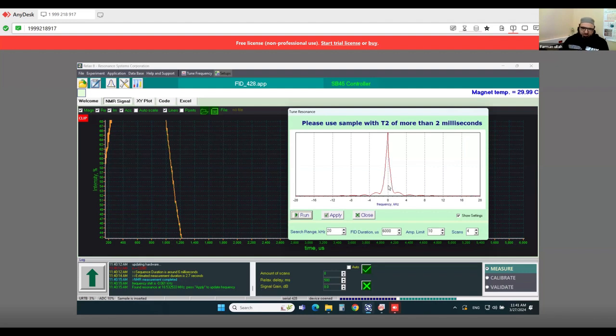There may also be some other factors, but as I told you, you have to give some time to the sample to get the uniformity. So I'm also showing you today some drawbacks or hurdles which come in performing these time domain experiments, which I get from my experience and from other colleagues' experience. So this can happen. We found solutions for some of them, and some of them we are still searching.